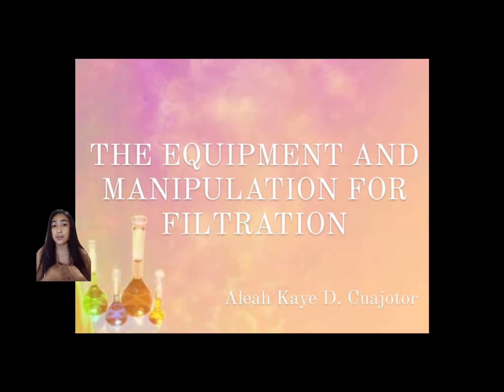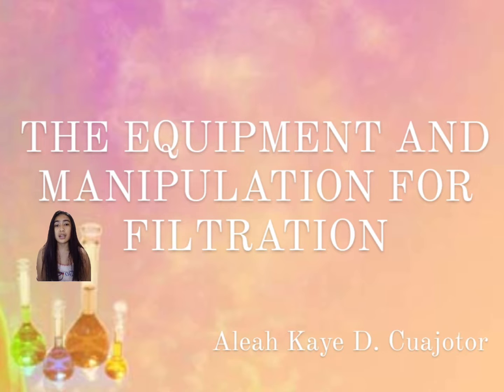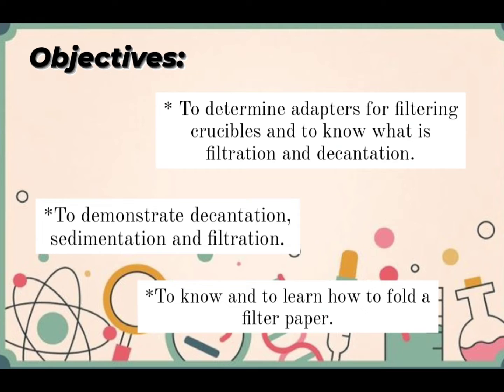Everyone, I'm Cuajotor, and for today's activity, Activity 3, which is the equipment and manipulations for filtration. We have three objectives in this activity. First is to determine adapters for filtering crucibles and to know what filtration is. Second, to demonstrate decantation, sedimentation, and filtration. Last is to know and learn how to fold a filter paper.